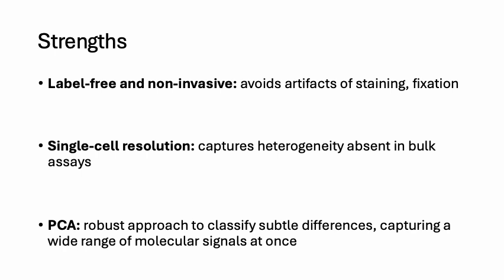Another strength that I found was focusing specifically on the nucleus, which is the main site of chromatin rearrangement, transcription factor activity, and other hallmarks of differentiation. And this nucleus-centric approach increased the likelihood that subtle changes in protein and DNA organization would translate into detectable spectral shifts. On the computational side, PCA is a robust tool for high dimensional data, and the author's consistent preprocessing strengthens confidence in the observed cluster separations.